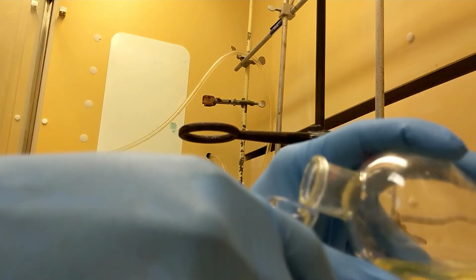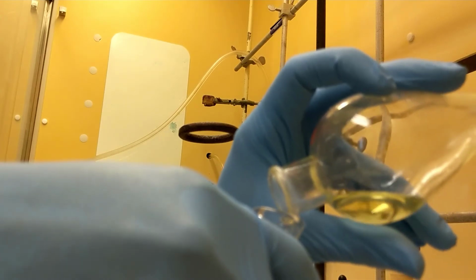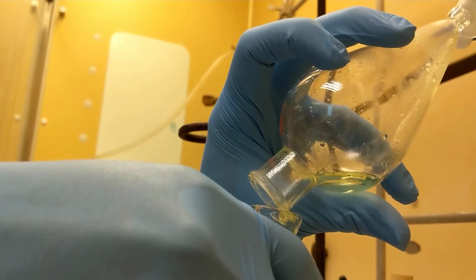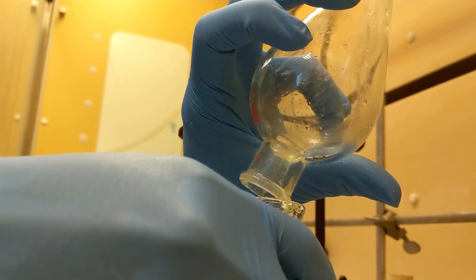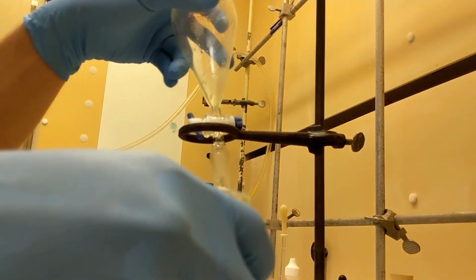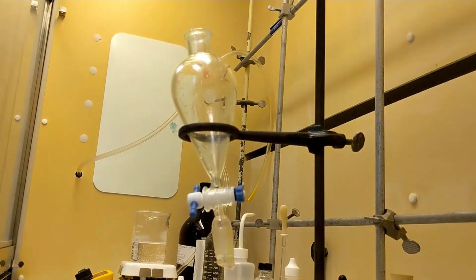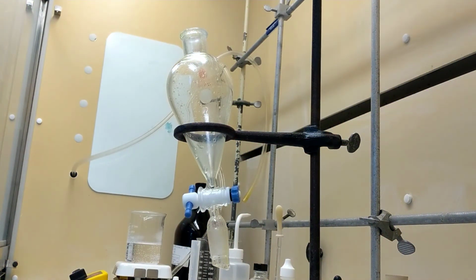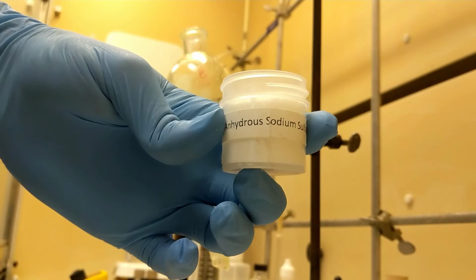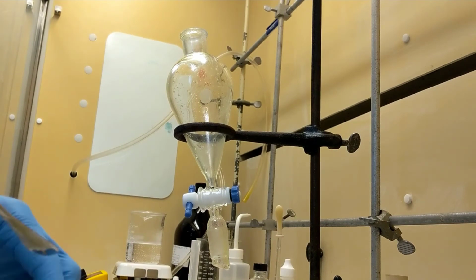I'm just going to pour the ether out of the top. There we go. Got my ether. Just like the other experiments, now I'm going to dry it by again using anhydrous sodium sulfate. Just going to add it until it doesn't clump.